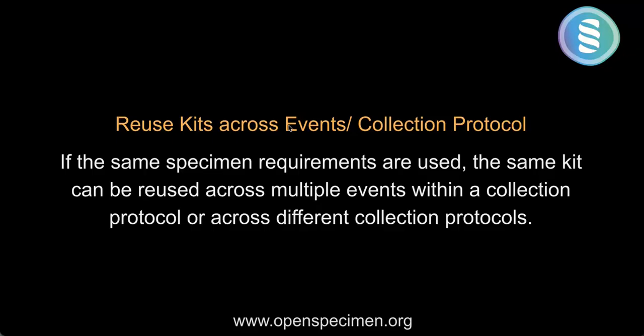So in this video, we demonstrated how kits can be associated with participants to automatically generate the specimen records. We also looked at how the same kit configuration can be reused across the events and collection protocols.